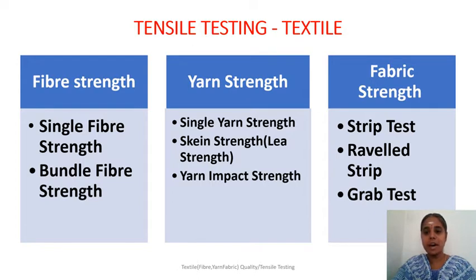Apart from this, for the fabric, you can do the tear strength also. Okay. So these are the various tensile tests that are done for fiber, yarn, and fabric. Apart from this, there are other tests also available.